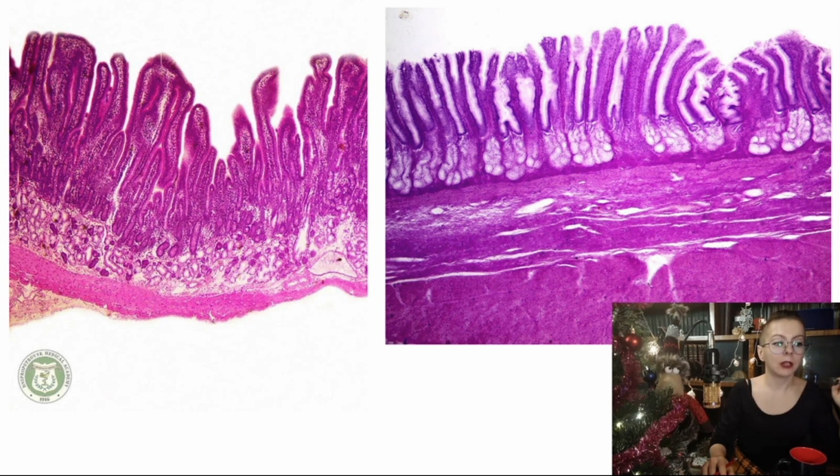Very, very easy. The thickness of muscular envelope. Muscularis in the duodenum is relatively thin comparing with the mucosa and submucosa. While in the pyloric part of the stomach, muscularis is very, very thick, much thicker than the mucosa, because close to the sphincter region. So look at the muscles and you'll see the difference very exactly.